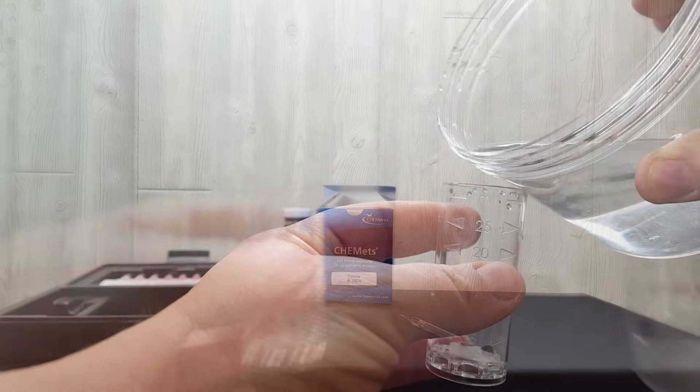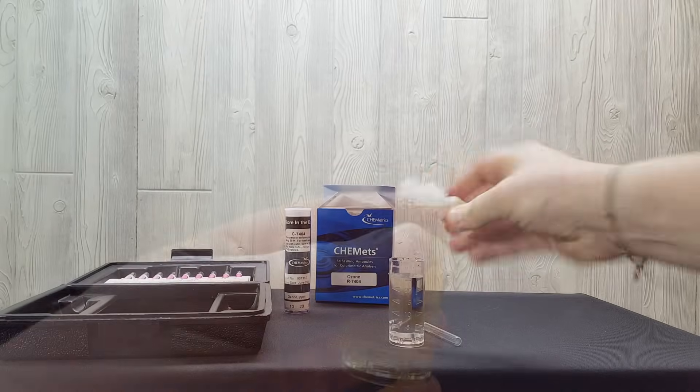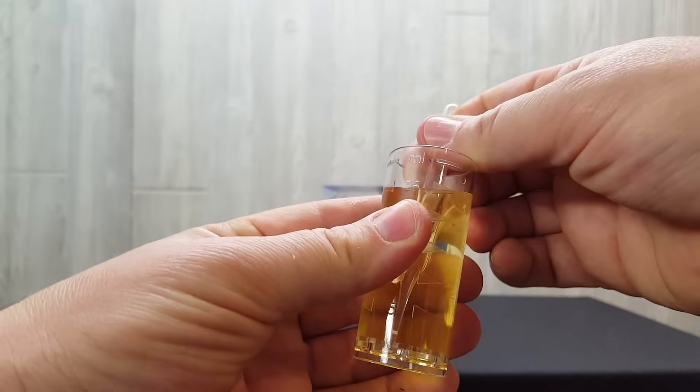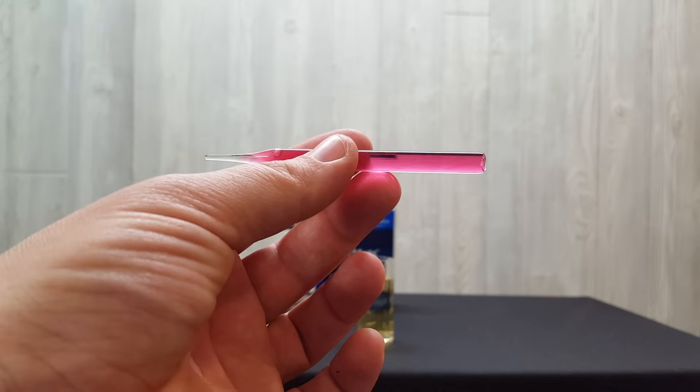This video shows how to measure dissolved ozone levels of approximately 6 parts per million by diluting the sample by half. You can dilute the sample by up to one-fifth — use one part dissolved ozone and 4 parts distilled water, then multiply the results by 5. This would allow you to measure dissolved ozone levels of up to 15 parts per million.